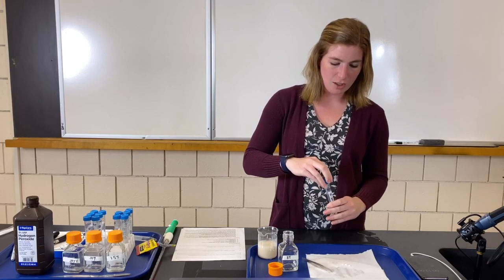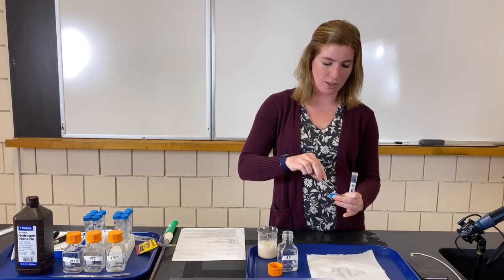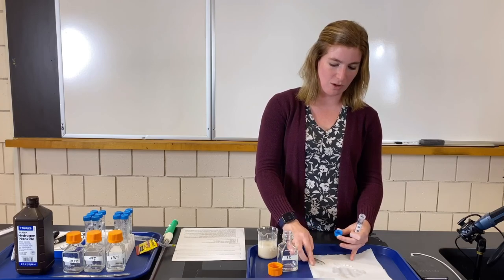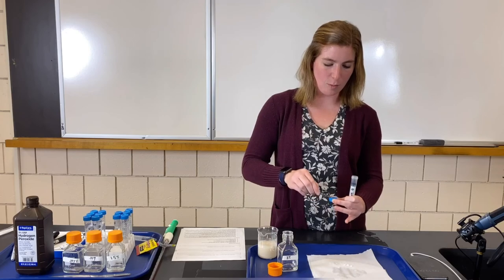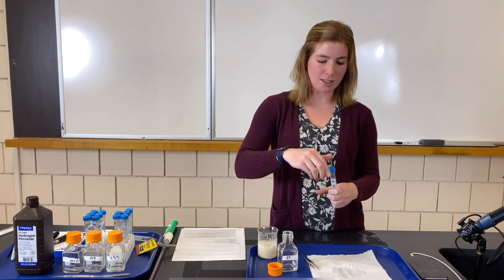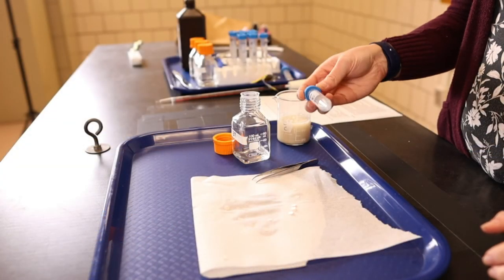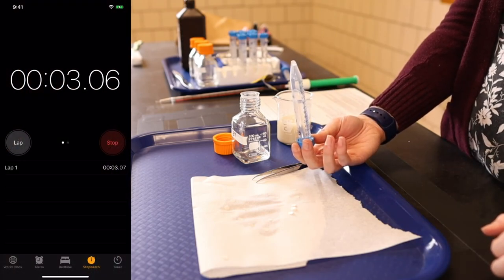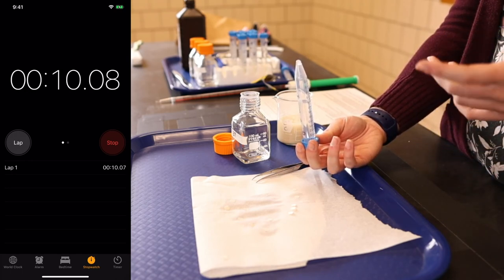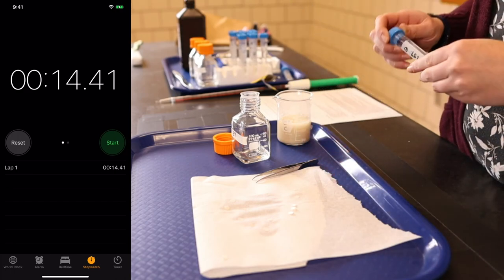Now we're moving to a lower concentration of hydrogen peroxide. The enzyme concentration should be the same across all trials because that comes from the yeast, but I'm changing the concentration of the substrate — the thing being broken down. As the substrate concentration decreases, think about what might happen to the time. Trial one of 1.5%: with less substrate there's less material for the enzyme to break down. Should it take more or less time to produce enough gas? It reached the top at 14.41 seconds.